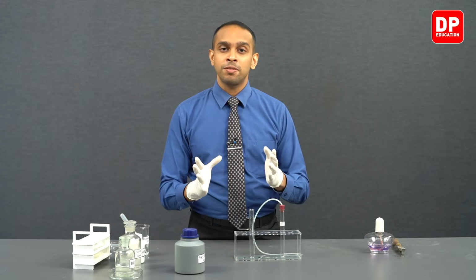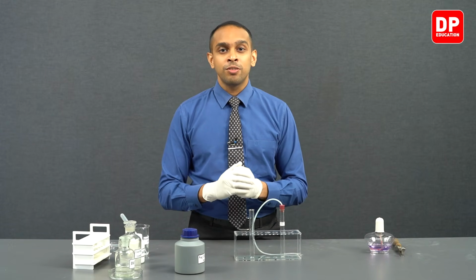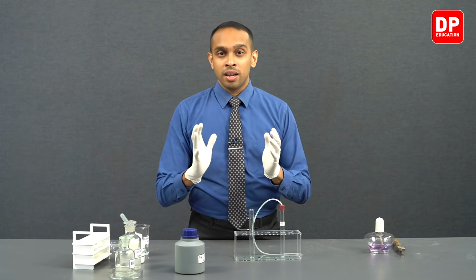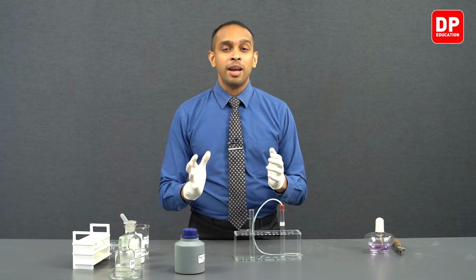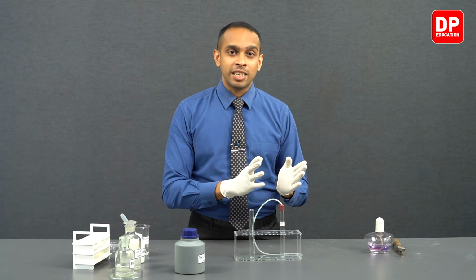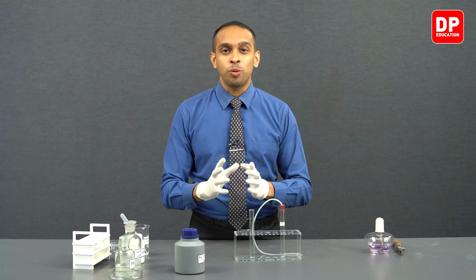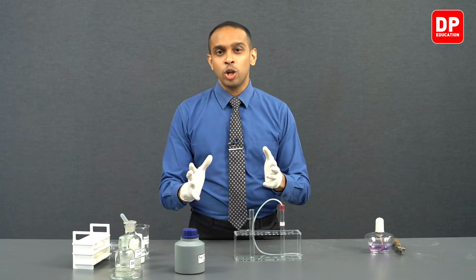However, how do we identify the presence of carbon dioxide gas? Carbon dioxide gas, when sent through calcium hydroxide, which is also referred to as lime water, will turn it milky. This is due to calcium hydroxide reacting with carbon dioxide to form calcium carbonate solid, which is a white color, water insoluble precipitate. But this solid is going to be formed in such fine particles. They distribute throughout the aqueous medium to form a milky solution.